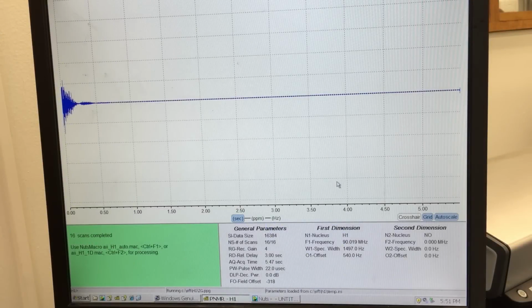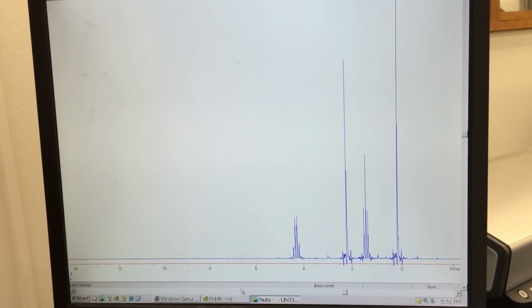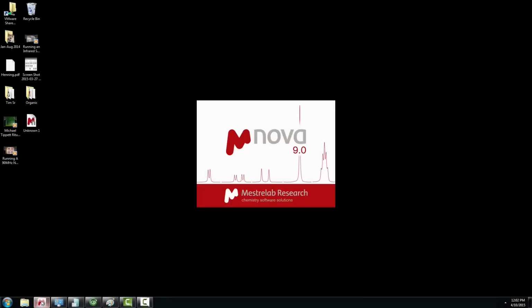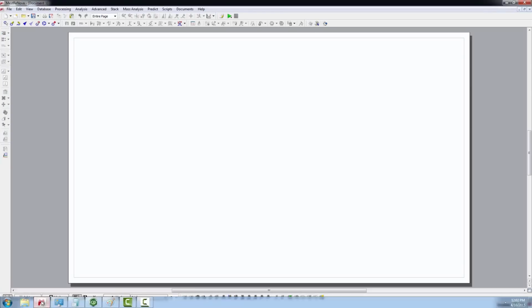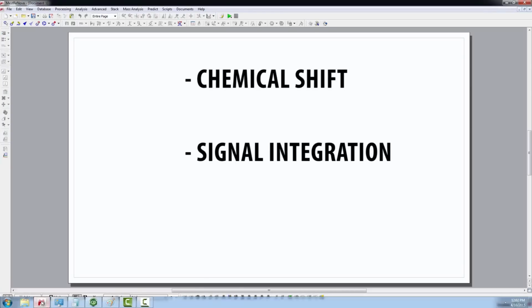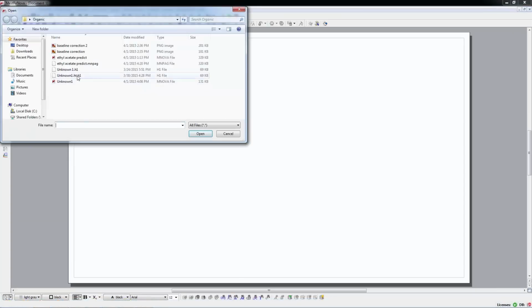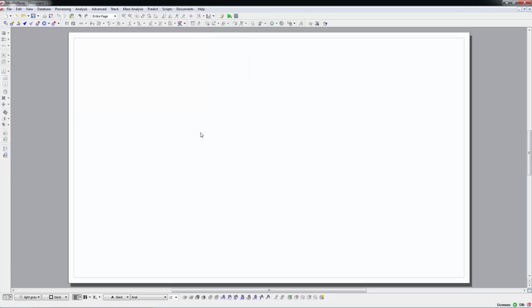While it's possible to process and analyze NMR spectra at the workstation, it's more convenient to take your data to another computer. MestreNova is a very powerful application. We'll only need its most basic functions: measuring chemical shift, integration, and producing a well-formatted spectrum for inclusion in lab reports. To begin, open the .h1 or .fid file using either the dialog or dragging and dropping.